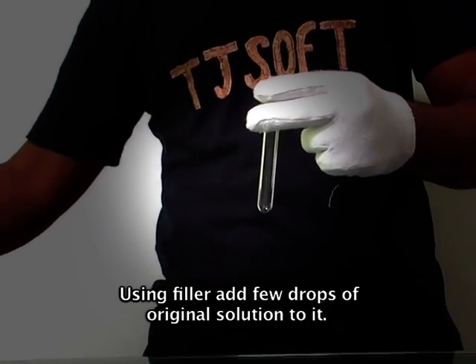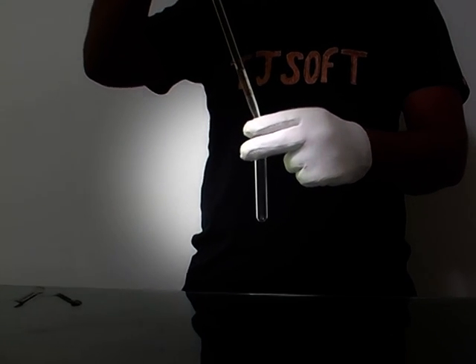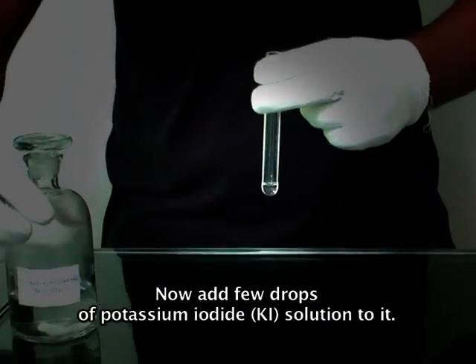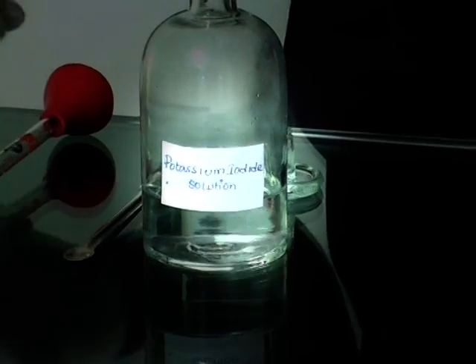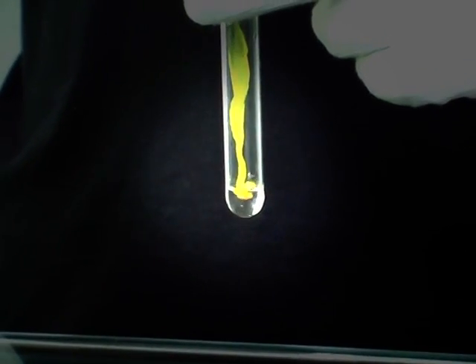To confirm it again, take another test tube. Using a filler, add few drops of the original solution to it. Now add few drops of potassium iodide solution to it.